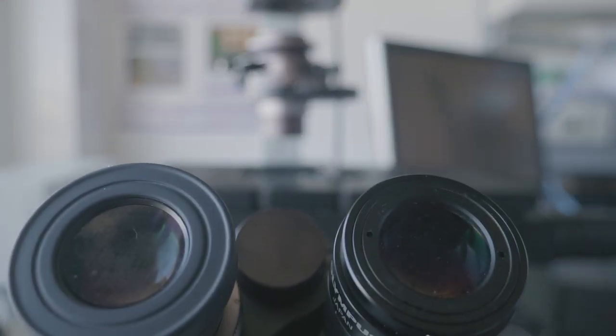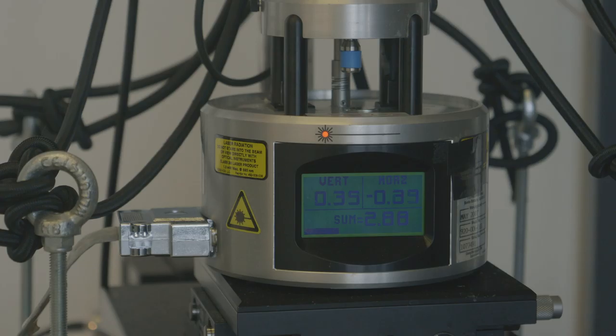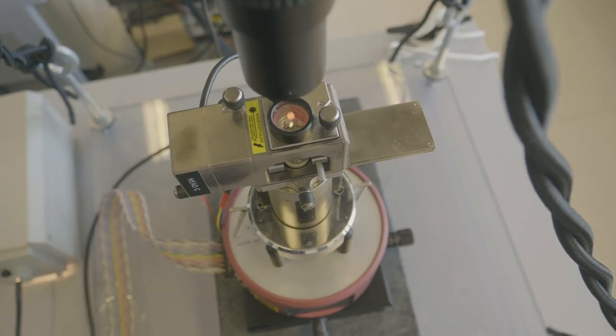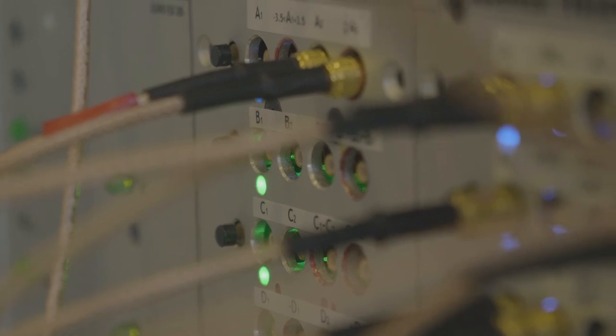As part of what we do in our research, we develop new measurement tools and instruments. There was a big barrier to labs adopting our tools because for them they were big black boxes, they were a bit scary, and they definitely could not build them by themselves.